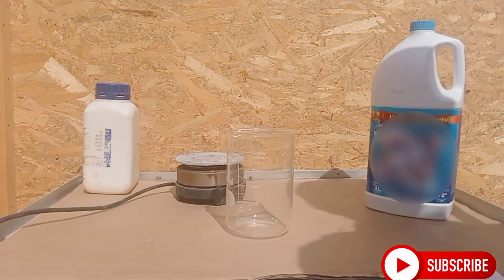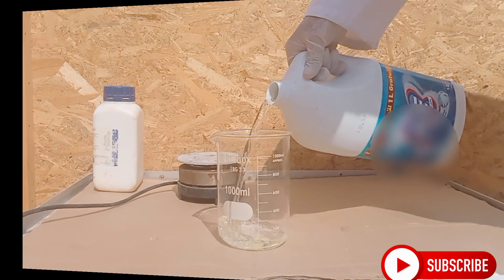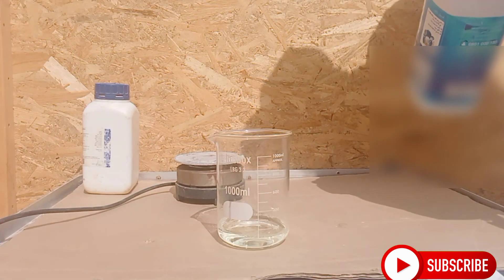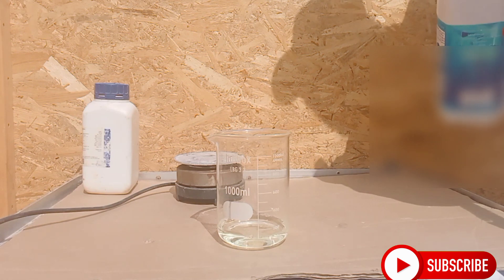How to make sodium chlorate for separating palladium? In this video we will make sodium chlorate.